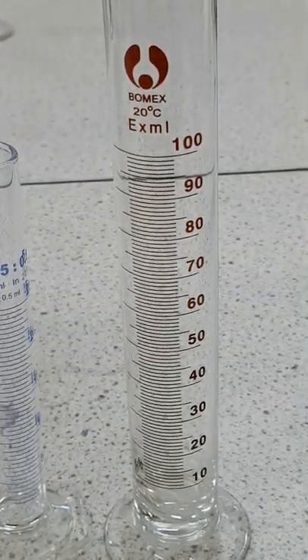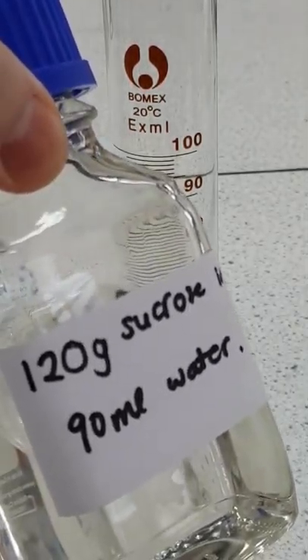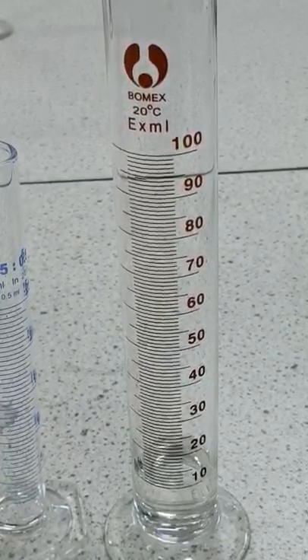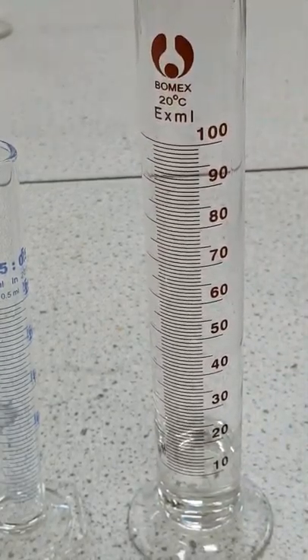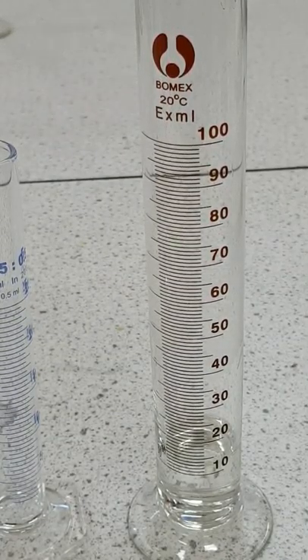We start off with 10 centimetres cubed of a sucrose solution that has 120 grams of sucrose dissolved in 90 centimetres cubed of water, so we need approximately 10 of that into the bottom of the measuring cylinder. We're going to acidify it with a few drops of concentrated hydrochloric acid — you could use a more dilute solution as long as it's acidified. If we swirl that quickly we can get it to mix, so we've got a dense sugar solution at the bottom of the column which has been acidified.